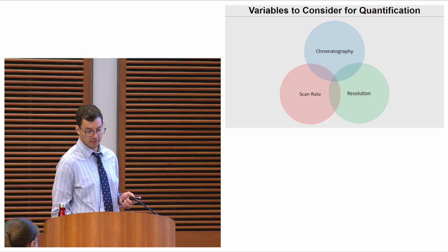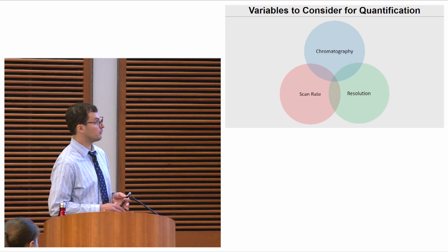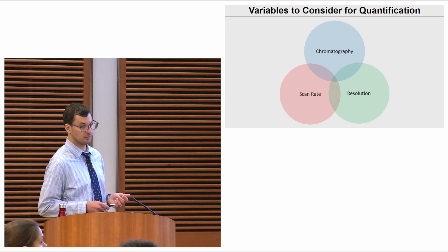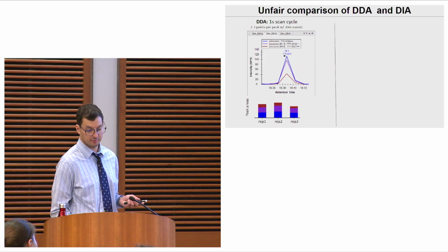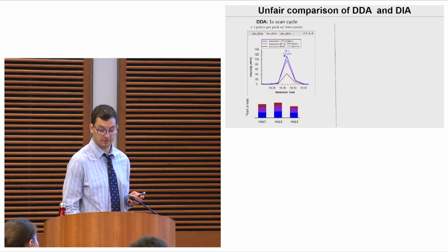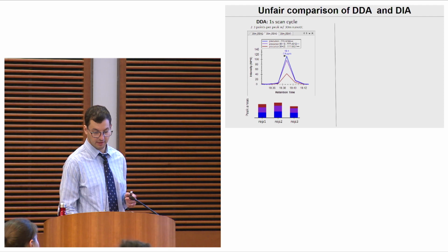The next point that I really want to emphasize is the importance of these three related variables. So remember, we need to match our scan rate to our chromatography, and our scan rate is intimately tied to the resolution that we set. And this is important for either DDA or DIA. And to emphasize this point, I'm showing you an unfair comparison that I did between DDA and DIA on accident.